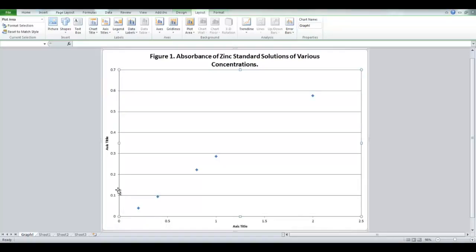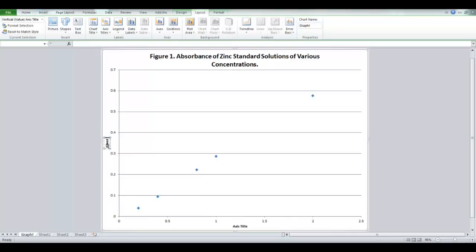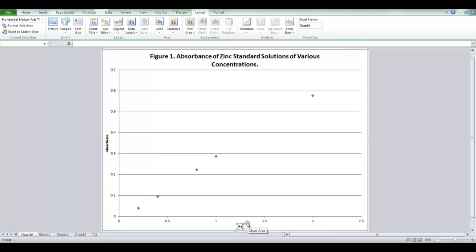So, double click on your axis titles, and you can name your axis. Don't forget your units. As you can see, I have absorbance here, and that doesn't have units. But down on the bottom, I put concentration, and that does have units. In this case, it's parts per million. Very, very important. Don't forget your units.